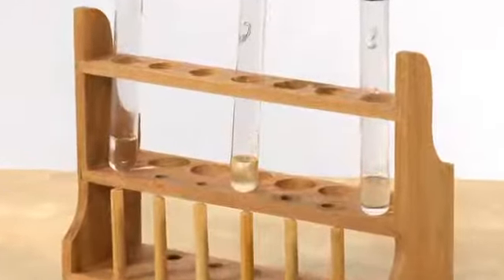Sudan 3 is a large organic molecule that likes fats. What do you think will happen in the different test tubes?